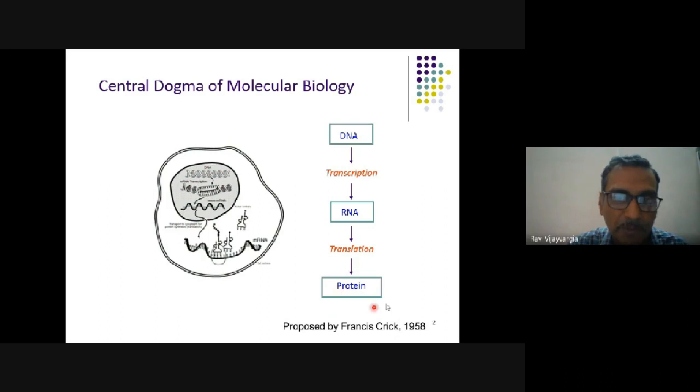This protein can be expressed in different systems. It can be in a prokaryotic system like E. coli, a highly regulated system, or it can be an endogenous system, where endogenous proteins are expressed, and then those proteins we are looking to purify. Different functions because of the different proteins they express. Roughly 25 to 30,000 proteins we have in a given cell type.